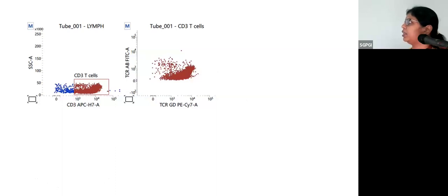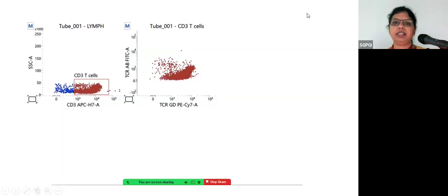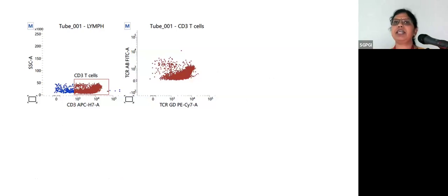So we could see that the major population had TCR gamma delta expression. But the case doesn't end here, because the lab doesn't stay away from the clinical profile of the patient. The follow-up says that once we said it is not an ALL, even in the morphology we hadn't committed it to be ALL. Our flow didn't show presence of blasts; CD34, TDT, CD99 were all negative, and there were not many aberrancies that we could conclude it to be a T-ALL.